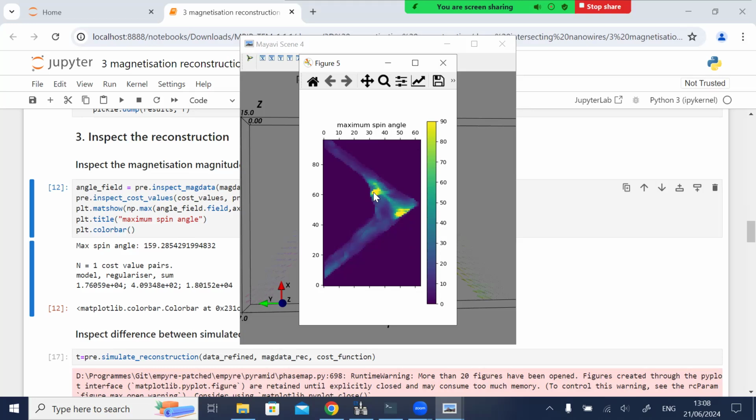These are what we call null zones, where when experimentally taking the images, the magnetic field components cancel, and we effectively have no information of what's there. To correct these, we would use a second tilt series and reconstruct both of them simultaneously, but that has not yet been automated in the code and requires too much human input.